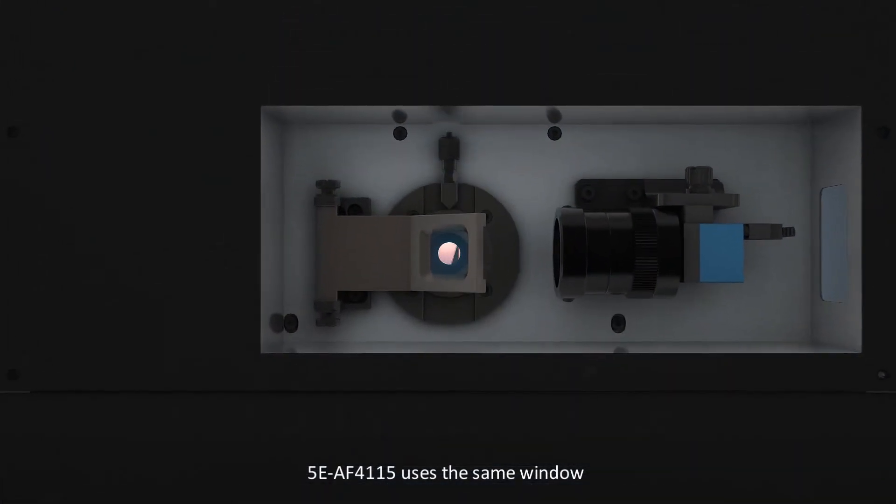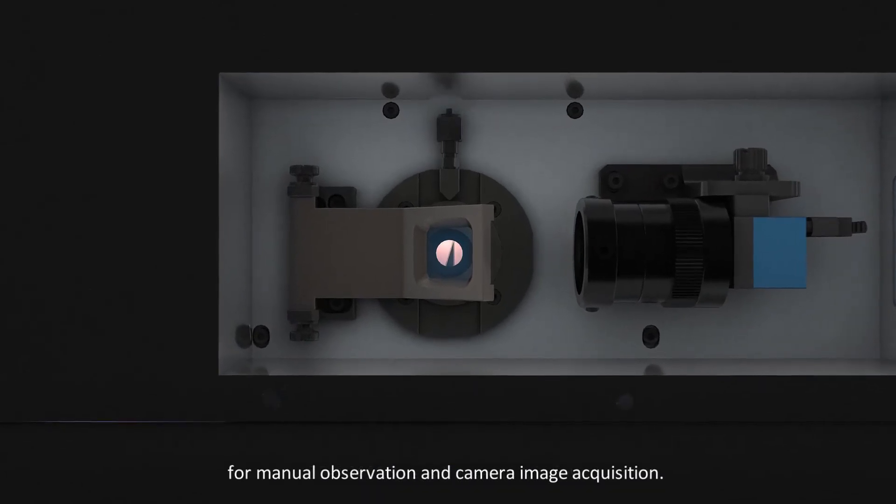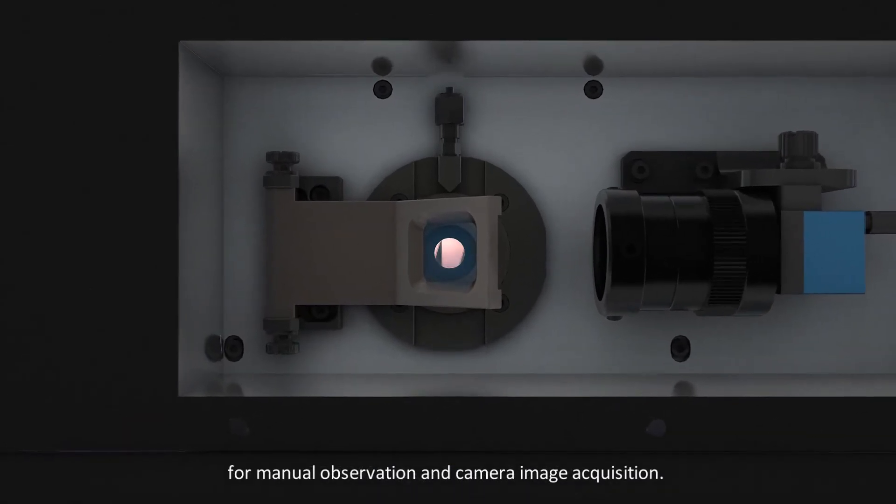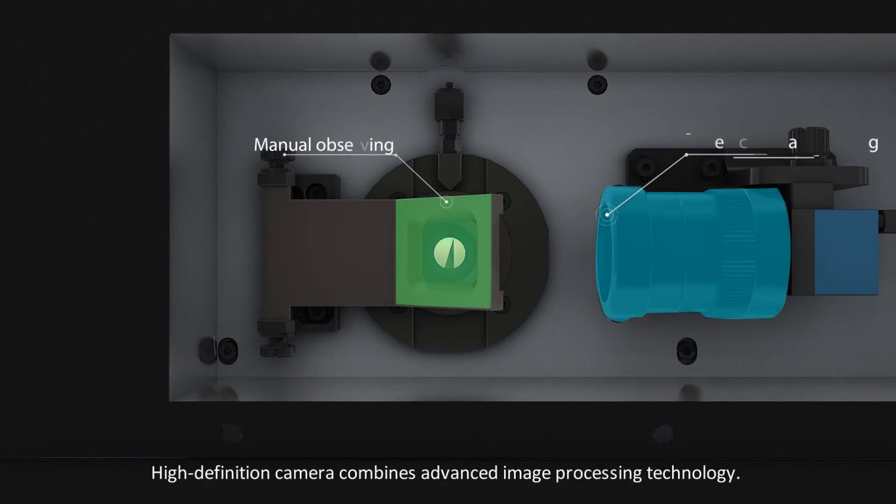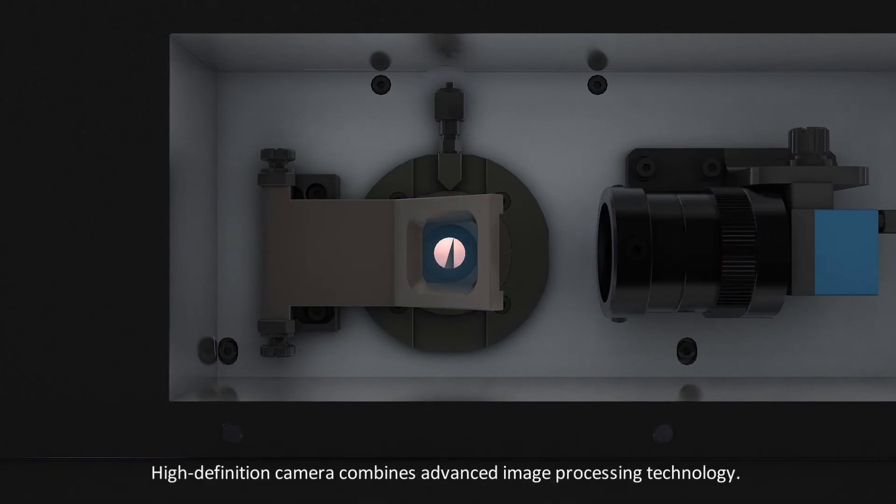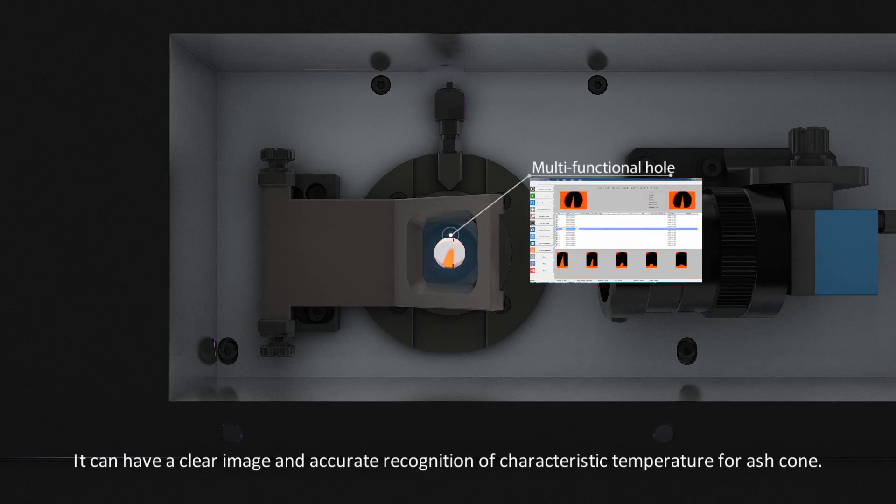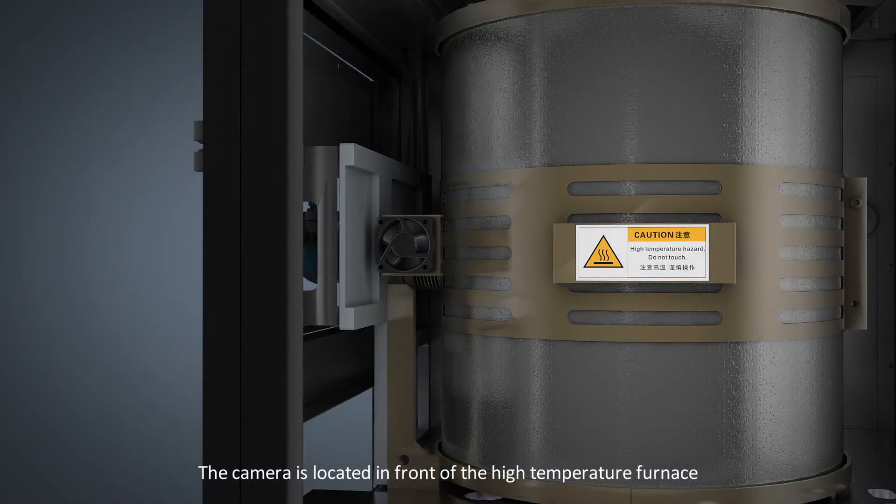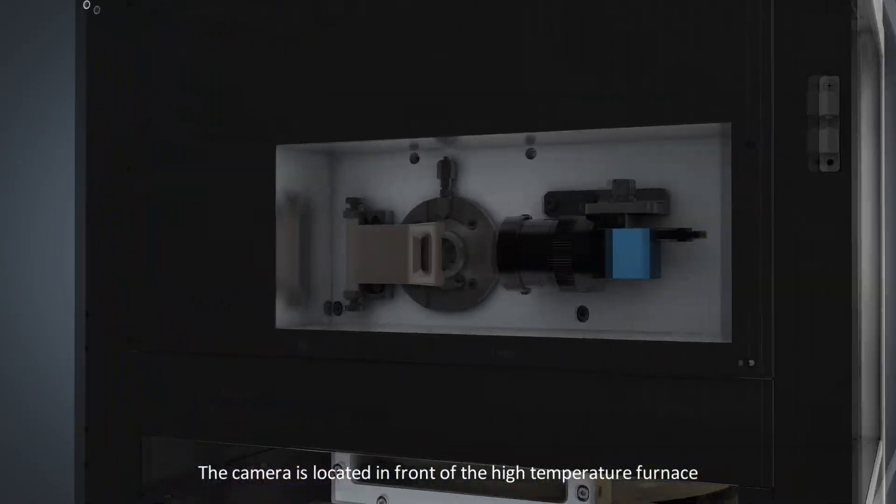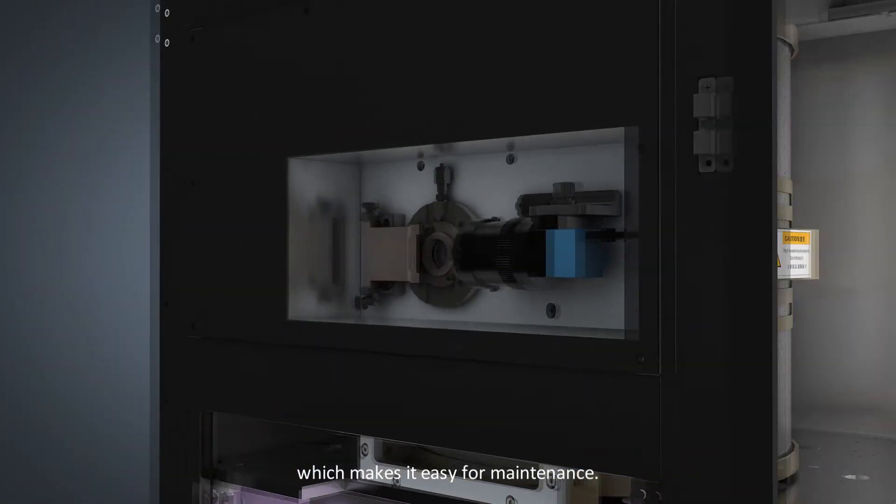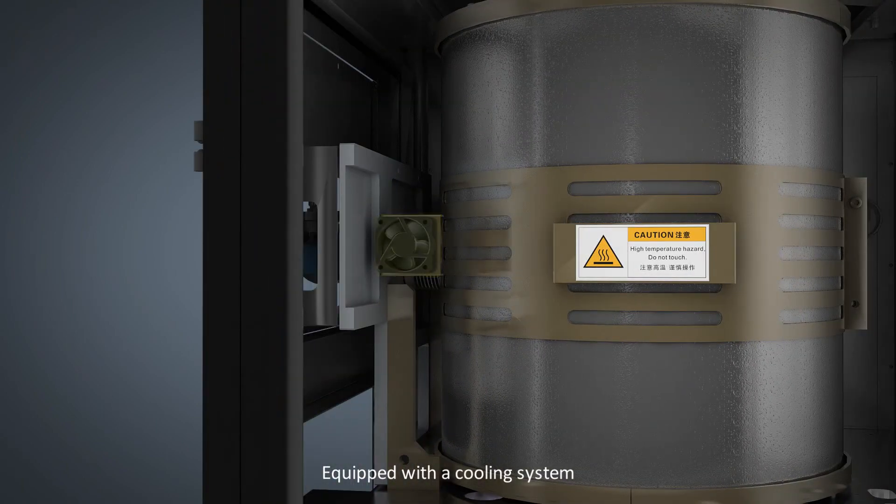The 5E AF4115 uses the same window for manual observation and camera image acquisition, ensuring consistent images. A high definition camera combines advanced image processing technology for clear imaging and accurate recognition of characteristic temperatures for the ash cone. The camera is located in front of the high temperature furnace for easy maintenance and is equipped with a cooling system to ensure stable operation and long service life.